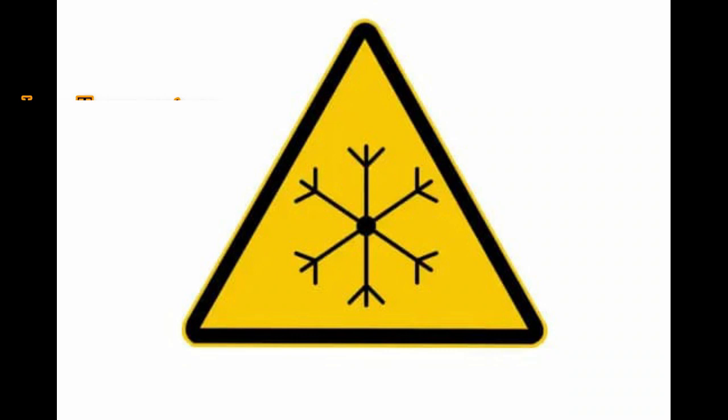Low temperature. At a glance, the symbol denotes low temperature or cryogenic hazards. These substances are often below freezing point and stored with chemicals such as liquid nitrogen. Stay safe. When dealing with equipment such as this, it is vital that personal protective equipment is worn. This includes, but is not limited to, thick rubber gloves that reach to the elbows, closed-toe footwear, rubber aprons, and face shields.